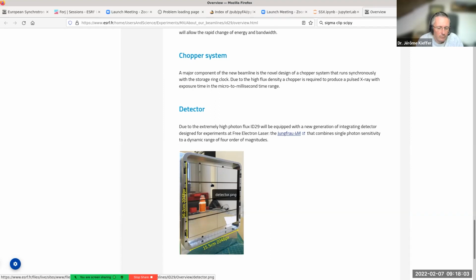For operating at full speed, we are limited by the amount of memory of the computer. For now, the computer has half a terabyte of RAM, but it could be increased to 2 terabytes if needed.